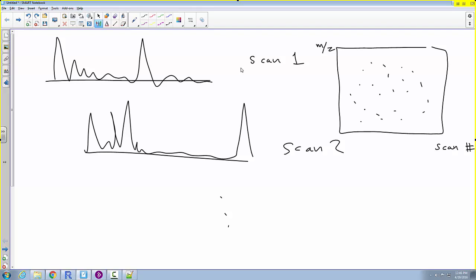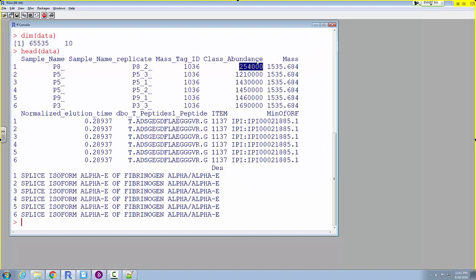And if we zoom in at a particular place, there are these peaks coming out towards us that represent a peptide. If we're able to locate one of these little clusters, a peptide, we can do the tandem mass spectrometry to get a better fingerprint and identify that peptide. If we blew up that spot that was circled, we could figure out the charge state, and we could figure out the mass, not mass to charge, but the actual mass. Once we know the charge state, we can figure that out. We could compare to a database to say that particular peptide is peptide X. And so that's where this number came from.